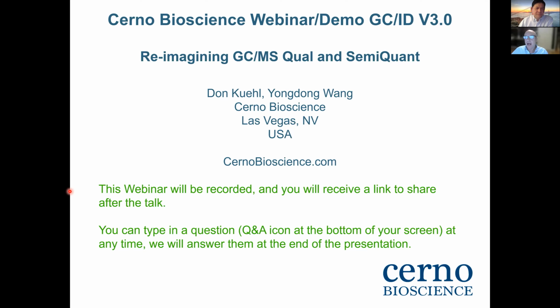I'm going to start out with a reasonably short PowerPoint presentation to kind of give you some background, describe some of the problems that we're trying to attack. And from there, we'll actually take a look at the product and we'll give some demonstrations with some actual real data to show you some of the unique and novel features of the software.